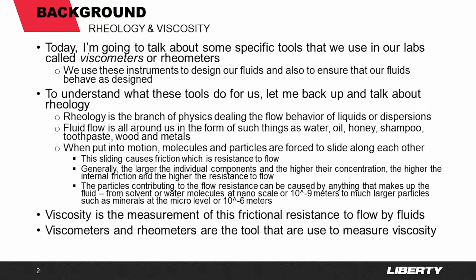Rheology is the branch of physics dealing with the flow behavior of liquids or dispersions. Fluid flow is all around us in the form of such things as water, oil, honey, shampoo, toothpaste, even wood and metals. When put into motion, molecules and particles are forced to slide along each other. This sliding causes friction, which is resistance to flow.